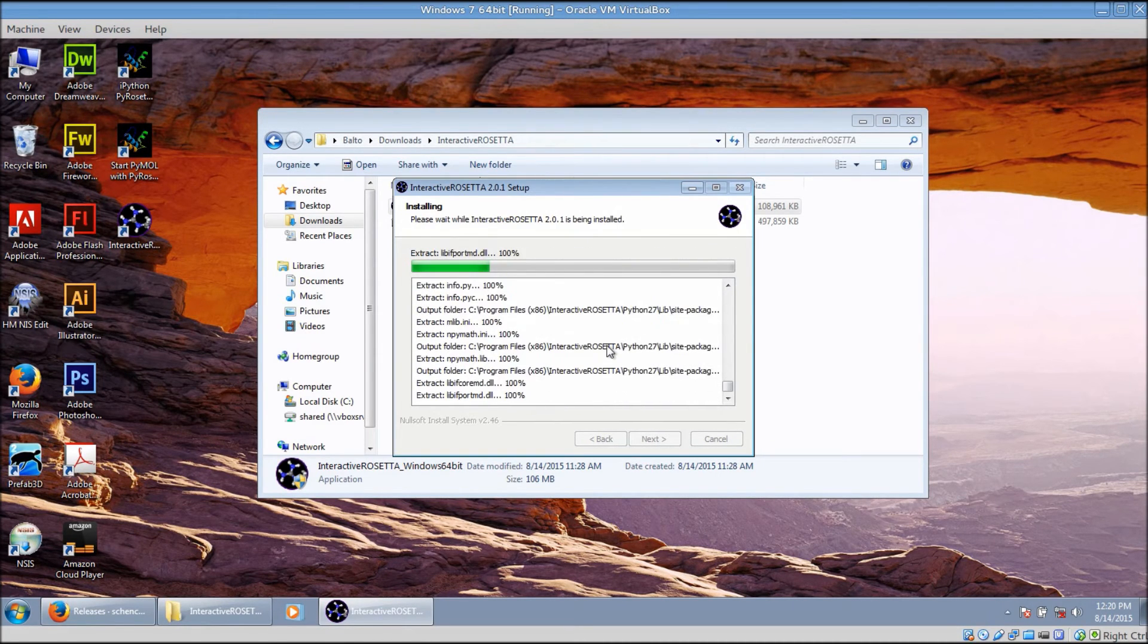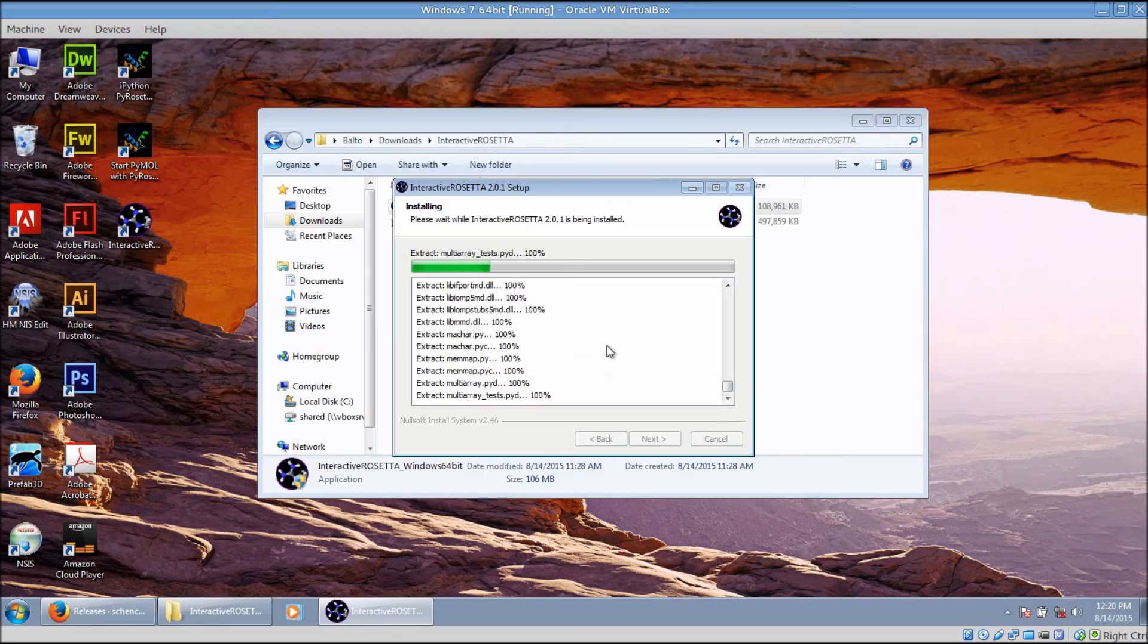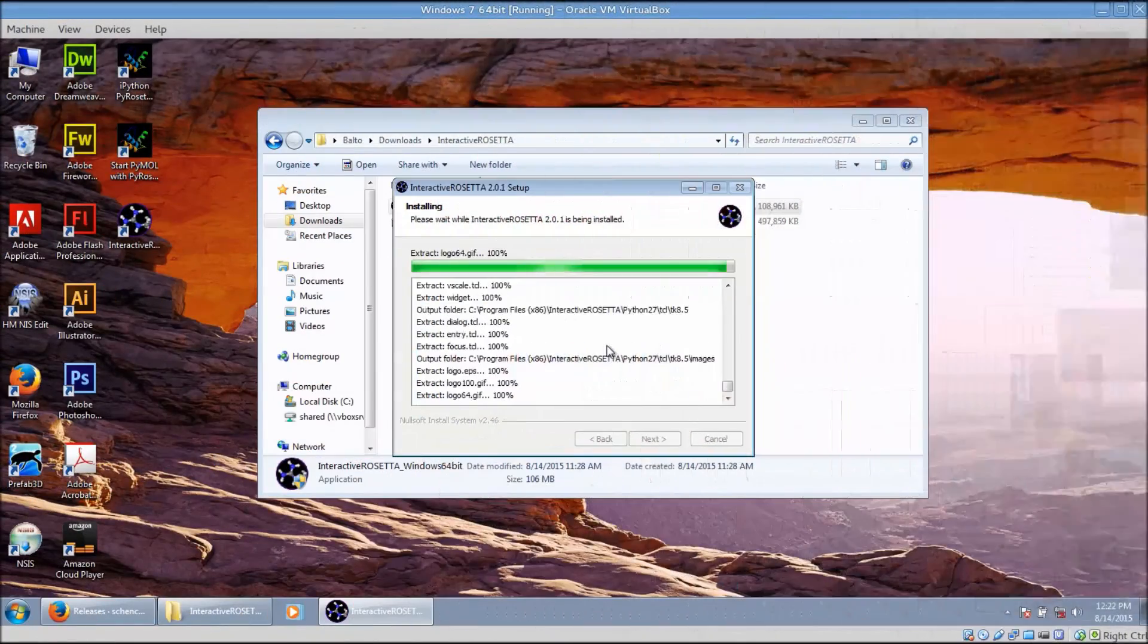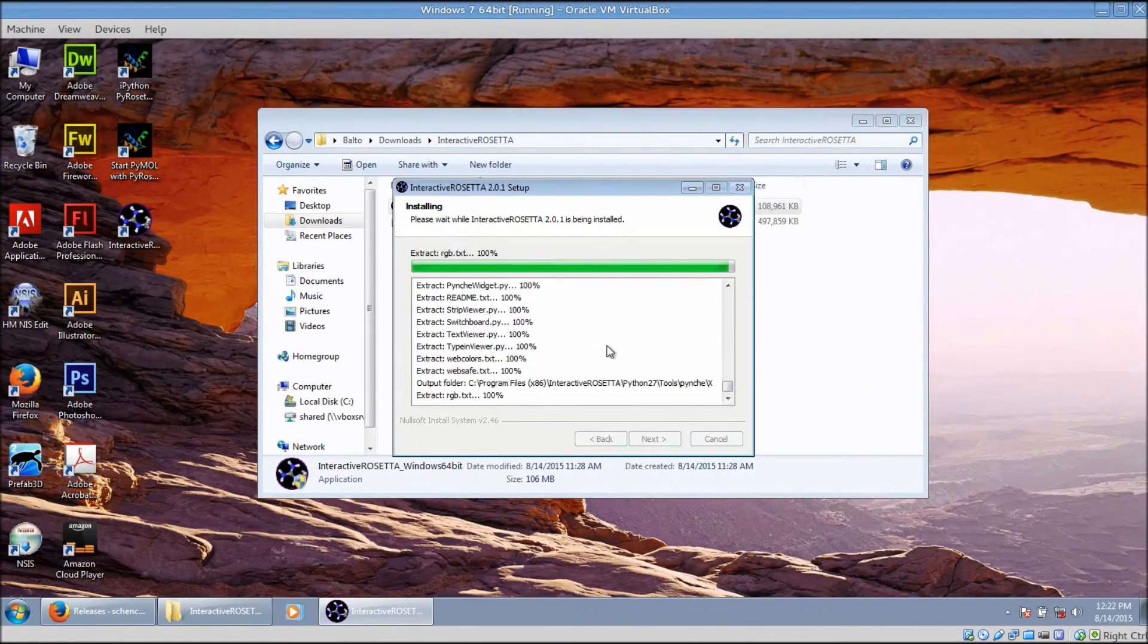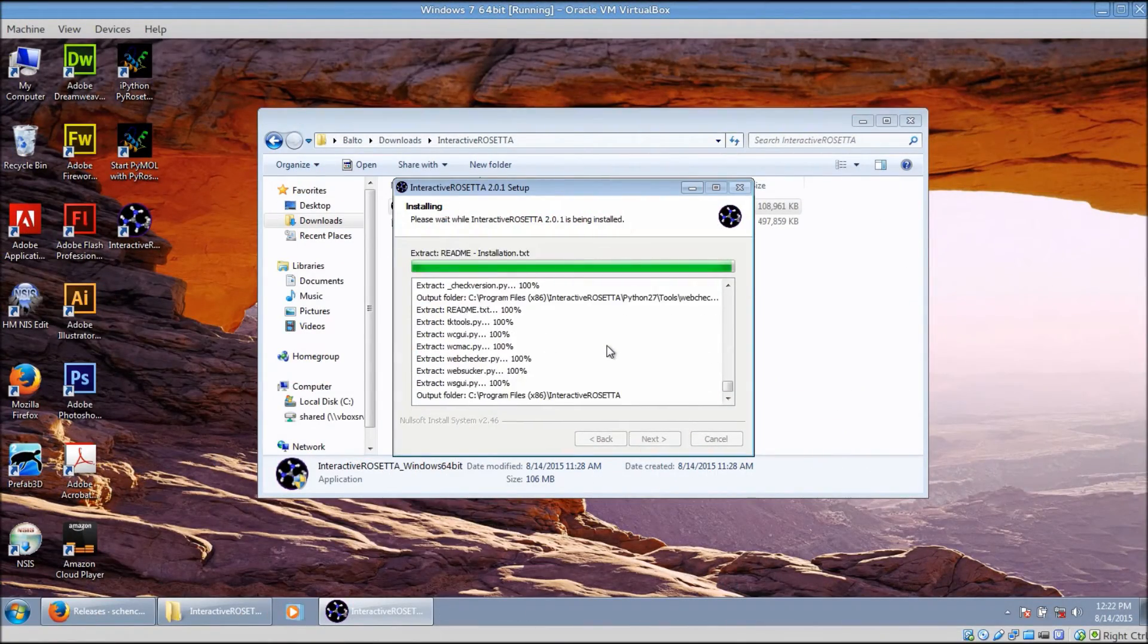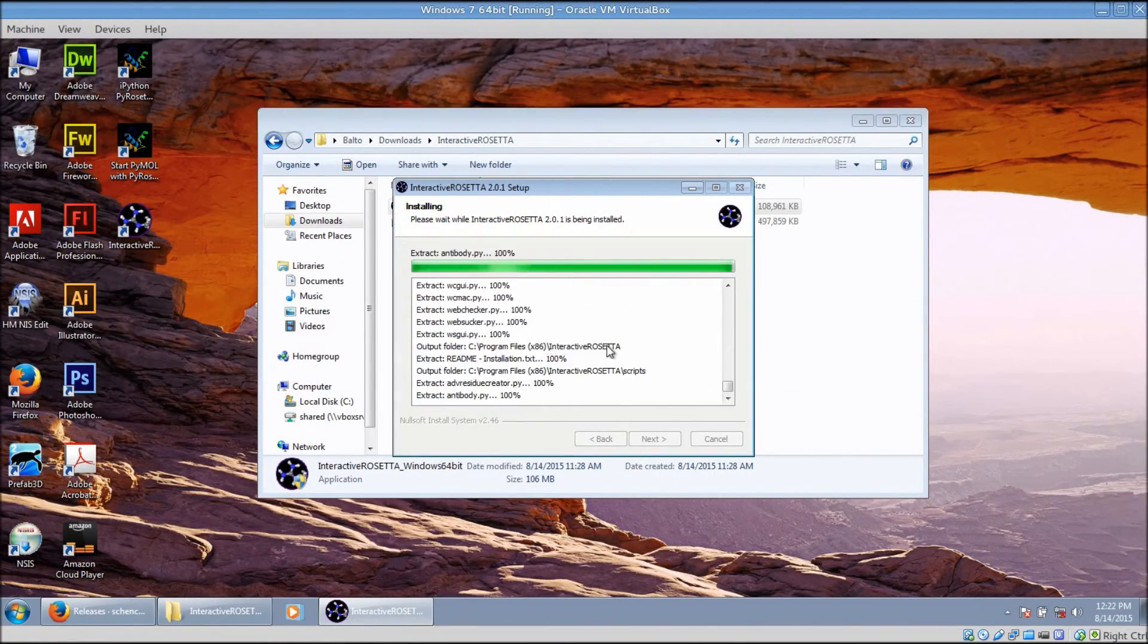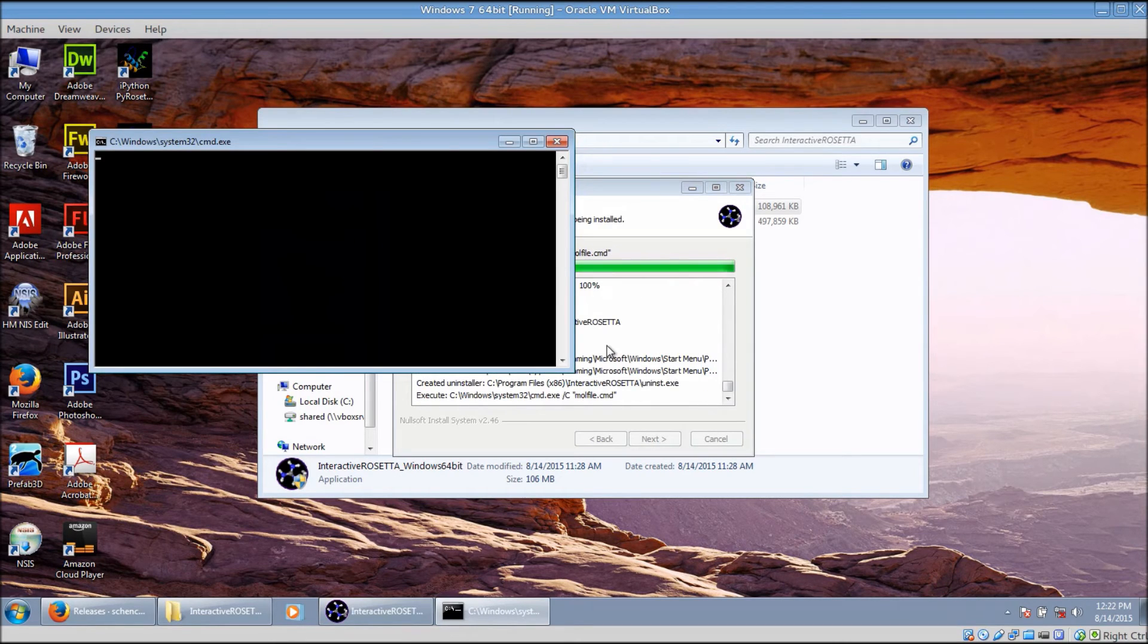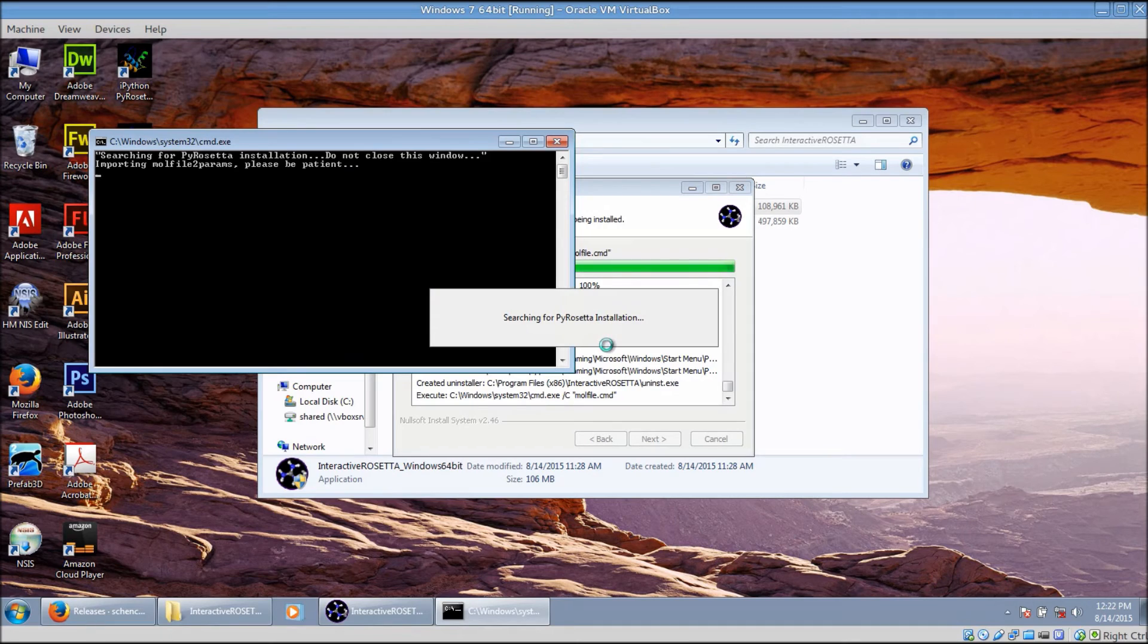This will also take a minute or so to install. Once it is finished, it brings up this black window when it attempts to import some files from PyRosetta.